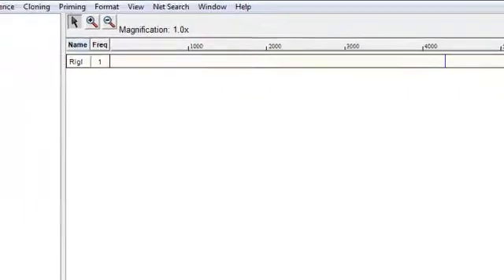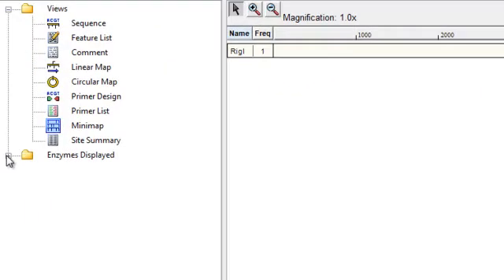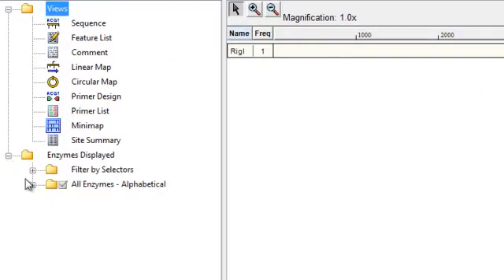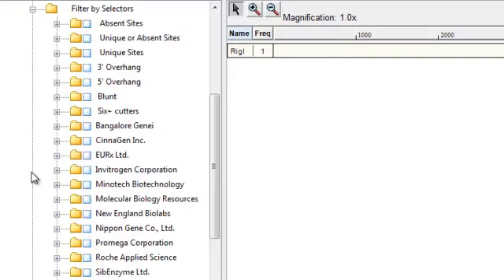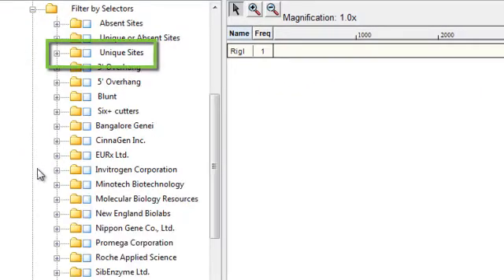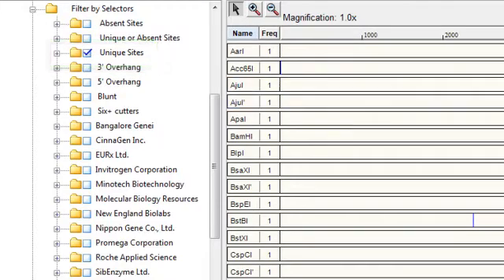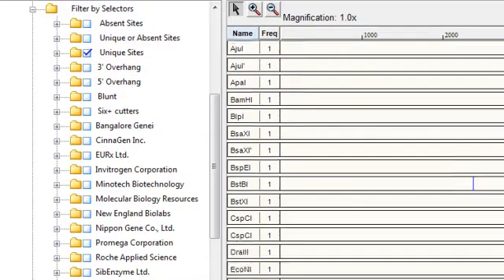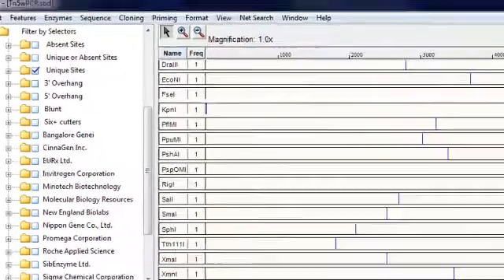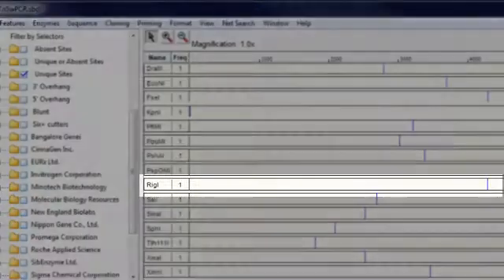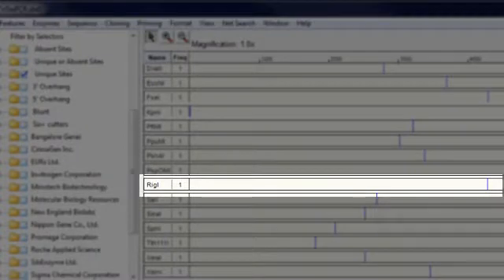So I could also use an enzyme selector to look for enzymes with unique cut sites, and we'll see that my enzyme, Rig1, gets applied that way as well.